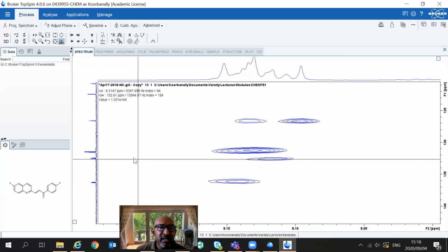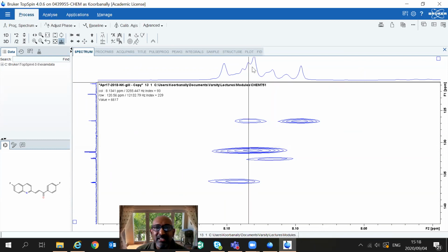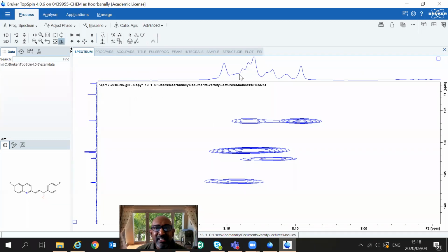And if I look here, there's my one, the very intense one is going to be coupled. So I can actually work on this and say that the resonance for these 2 protons must be in this region here. So I can actually say it's not in this particular region or that particular region, it's somewhere here. So I can go very nicely into this mess and look at it more in depth.